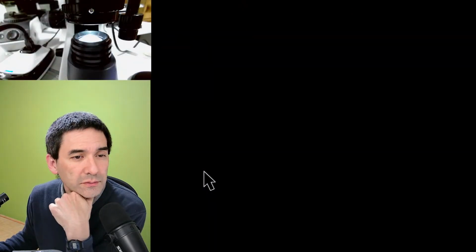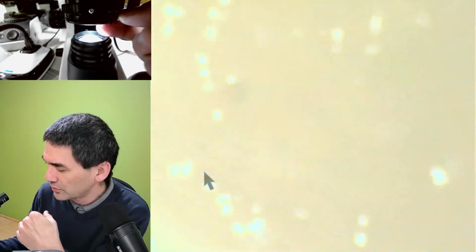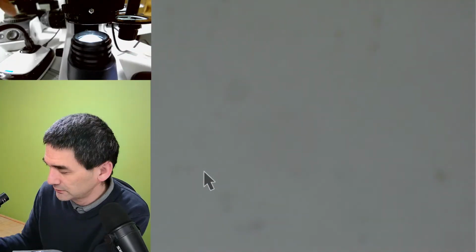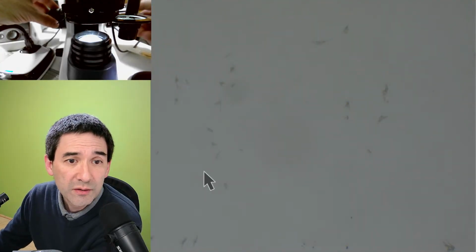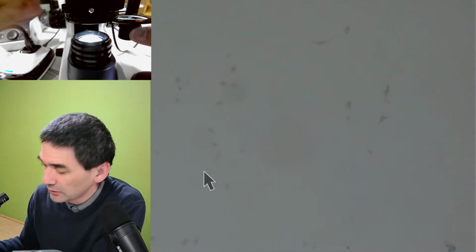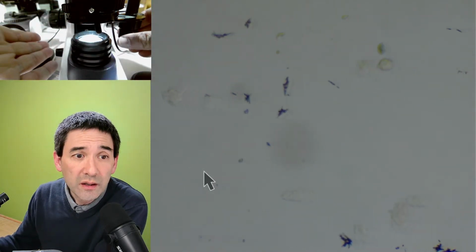First in bright field, again, those cheek cells, not being stained, are actually generally a fairly difficult specimen. And I hope that I've got enough in here now. Stereo view. Not stereo, here we go. I'm just going to use the regular, and I have to refocus. I'm going to always close the condenser.